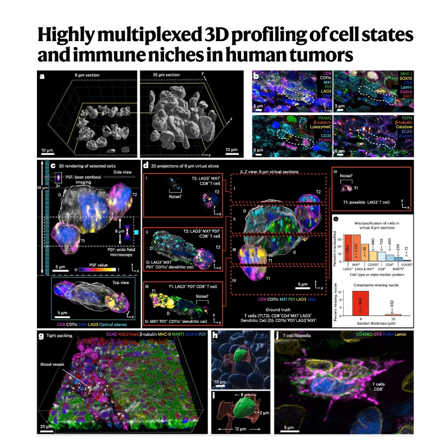3D imaging was absolutely essential to see these. They are highly extended cytoplasmic processes, often very long and thin. In a traditional 2D slice, these would just appear as meaningless, disconnected specks, if they were captured at all. You'd have no idea they were part of a larger functional structure reaching out from a cell. Give us an example from the paper. How significant are these structures when you see them properly in 3D?